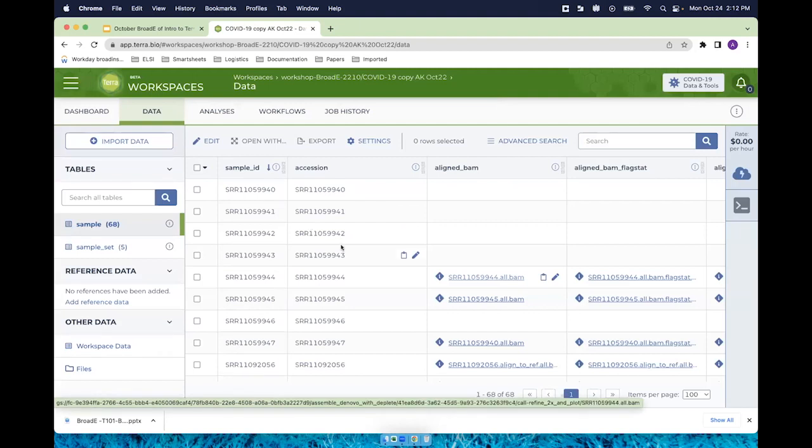And yeah, so in other words, tables link to the files where they exist. You don't necessarily need to move them to analyze them. In some cases, they still need to get localized, but you skip a very costly and inefficient step of having to bring them into different locations. They can just stay right where they are. So by using tables, you can keep track of the data that's related to the sample in one place, the row corresponding to the sample.